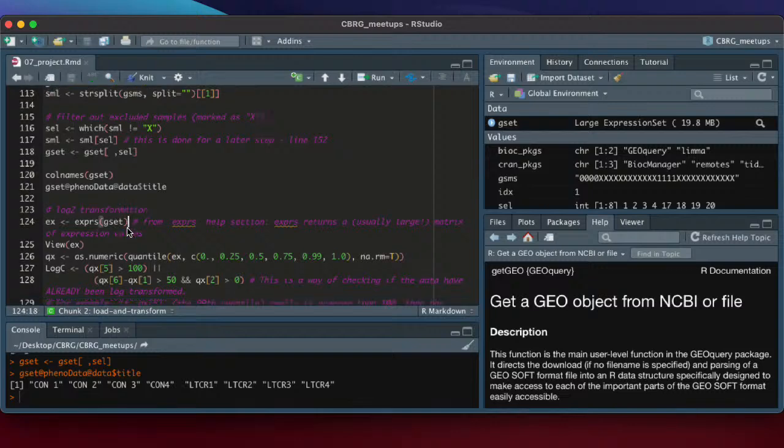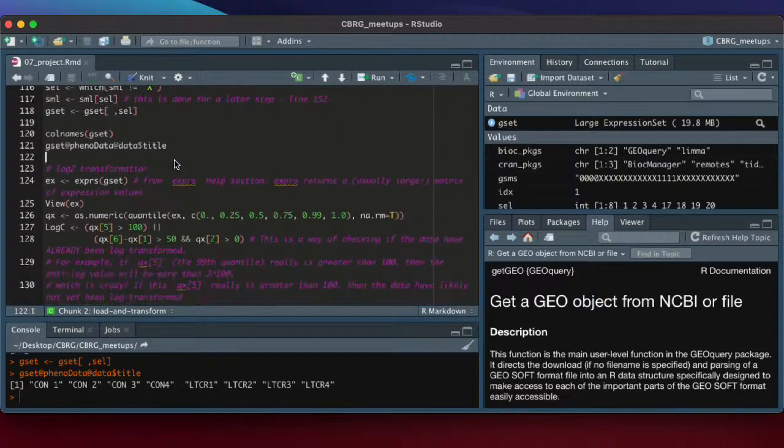The next step is, I mentioned that when you run this GetGEO to get the series matrix file, these are all data that have been pre-processed, by which I mean the data have been normalized and background corrected. And this is something that's essential to do for microarray chips. We do this so that we can validly compare samples with each other. One thing that is not necessarily done is Log2 transformation. Sometimes users do it, sometimes they don't.